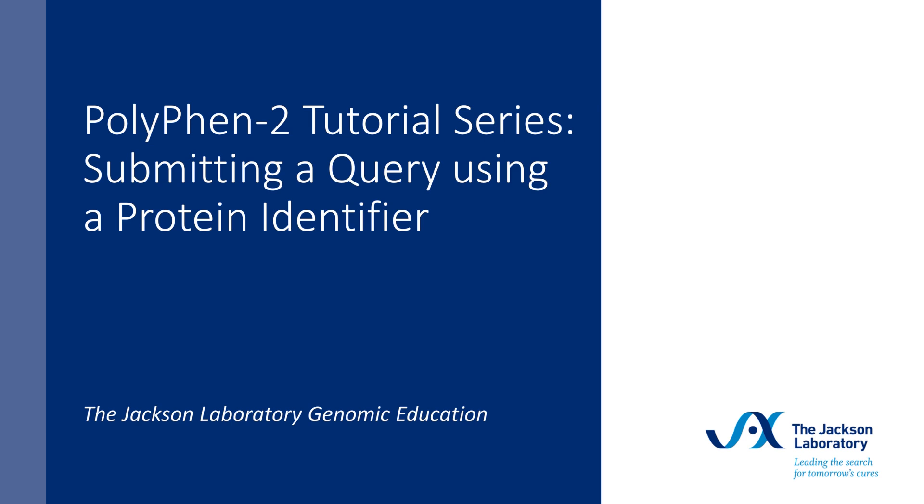Welcome to the PolyPhen-2 tutorial series, brought to you by the Genomic Education team at the Jackson Laboratory. This short video will demonstrate how to submit a query for a variant in a human protein to PolyPhen-2 using a protein identifier.